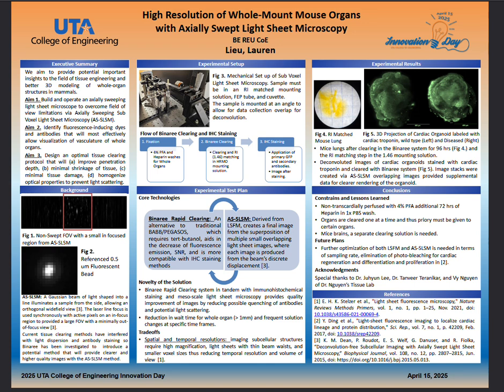So if we move to the experimental setup, figure 3 illustrates a sample in the light sheet microscopy setup. Do note that the sample is tilted to provide overlap of images when imaging, and that helps rendering later on in the protocol.